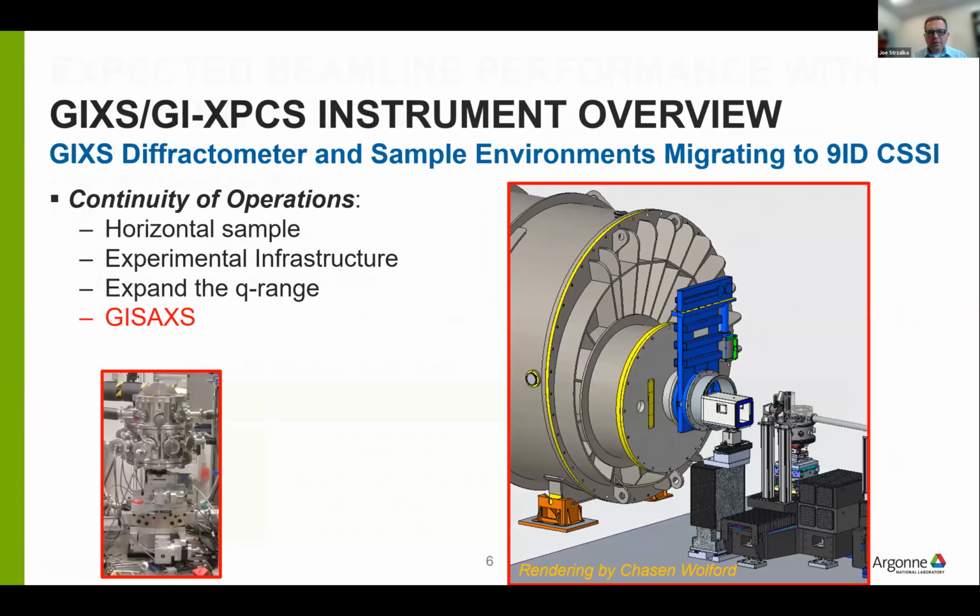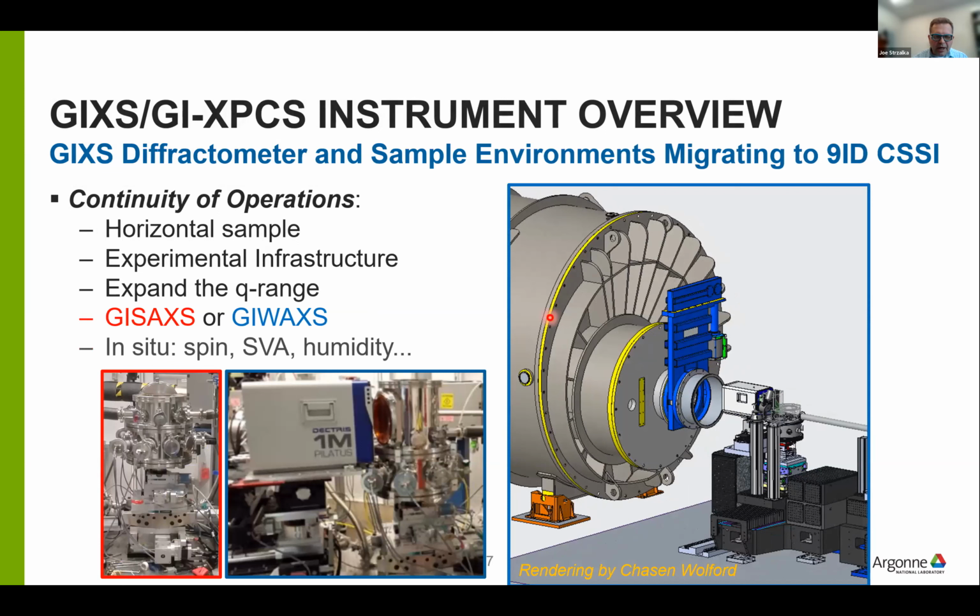The interferometer for the positioning alignment, right? In that case, you're right. So we are intending to do GISAXS and GIWAXS and GI-XPCS using the same diffractometer, and so that should promote synergy between being able to measure structure and kinetics and also dynamics on the same system.